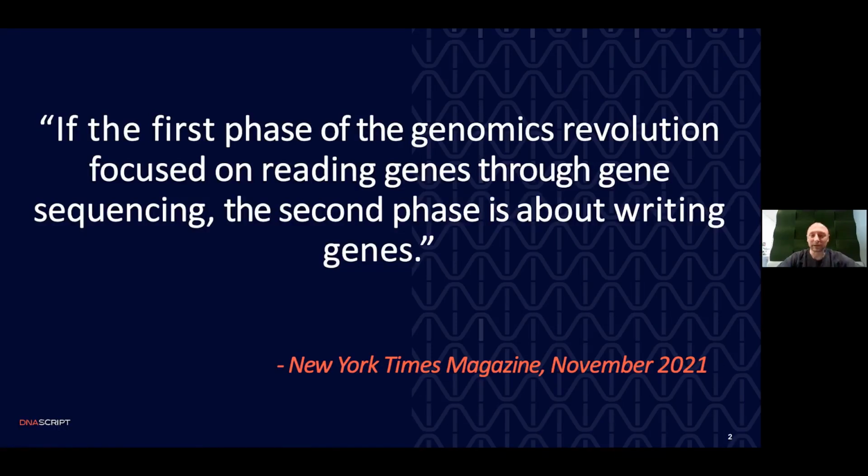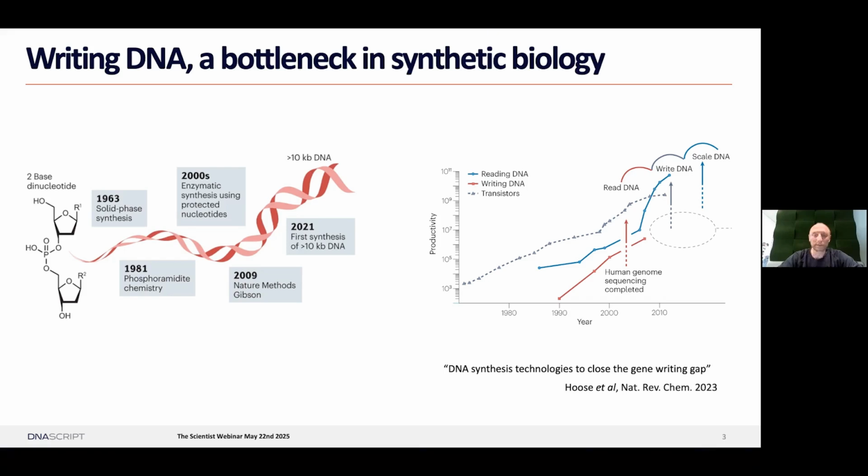Okay, so before I start, I'd like to tell you a bit about the company and also about DNA synthesis. I like to start with this sentence that really highlights how important writing DNA is in the revolution of synthetic biology. It is from an article in the New York Times Magazine, already from November 2021, and it really shows how nowadays DNA synthesis and writing DNA is a bottleneck for synthetic biology.